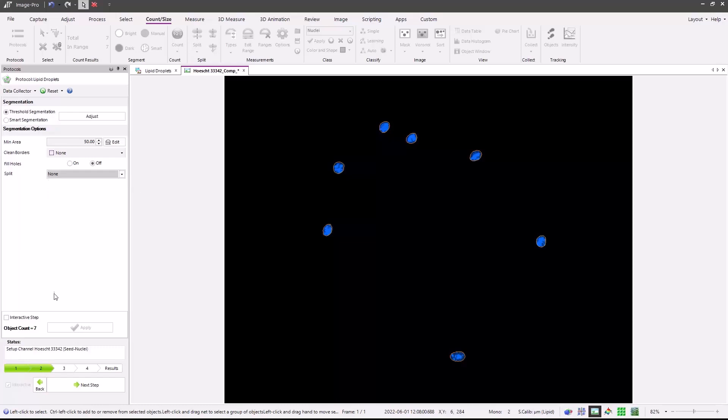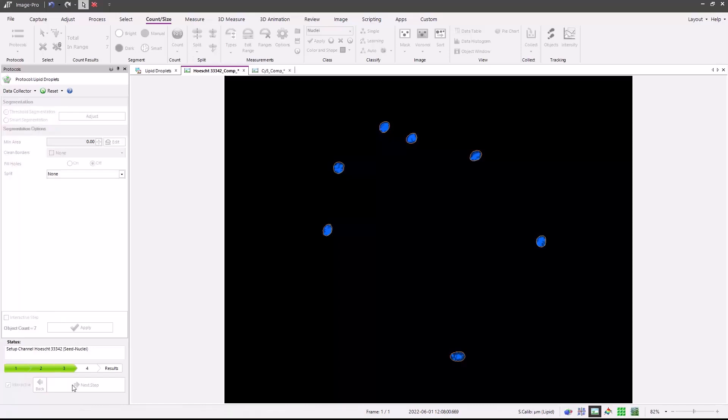As with most protocols, there is an interactive step, which means if you're running a protocol in batch mode where you're processing multiple plates or folders of images, you can stop at a particular step. This allows you to do that at this step and make adjustments as needed. Otherwise, the protocol will continue automatically. Press the next step button.